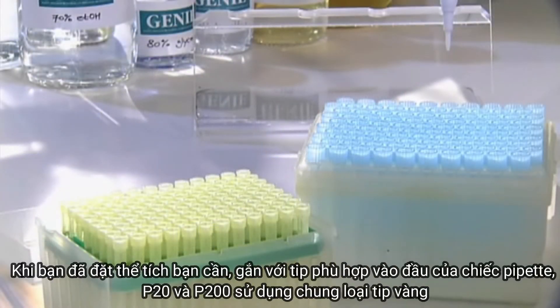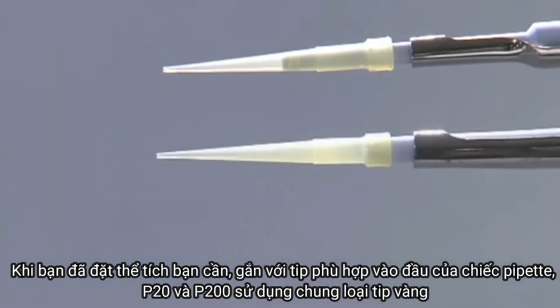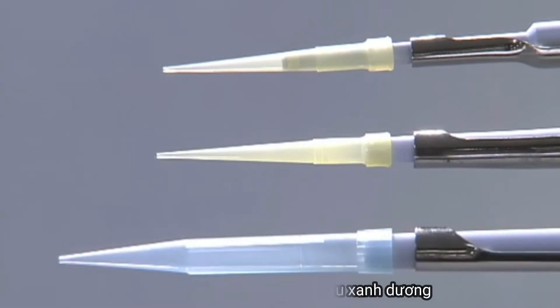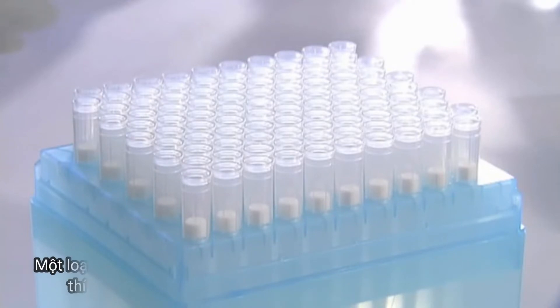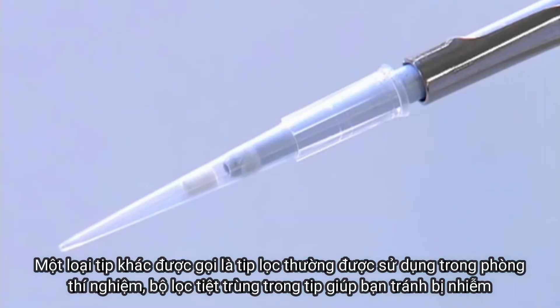Once you've set the volume, attach the appropriate pipette tip to the end of the pipette. P20 and P200 pipettes use the same yellow tips, while P1000 pipettes use larger blue tips. Another type of tip called a filter tip is often used in the laboratory — the sterile filter within each tip can help to prevent contamination.